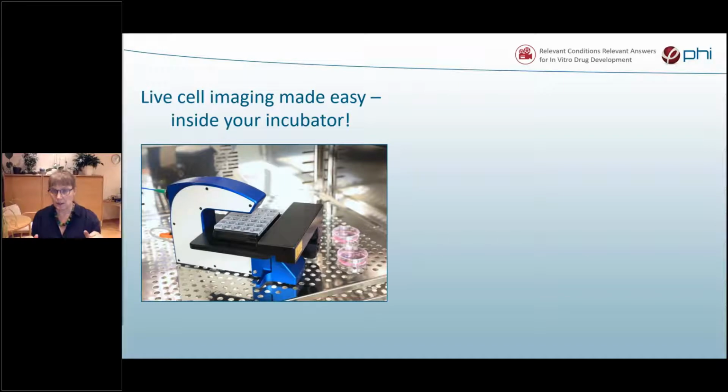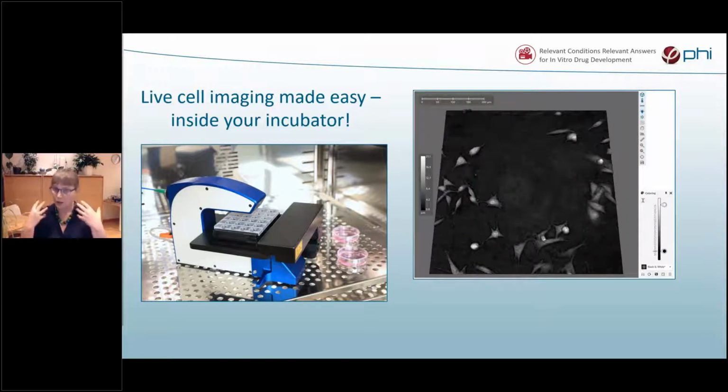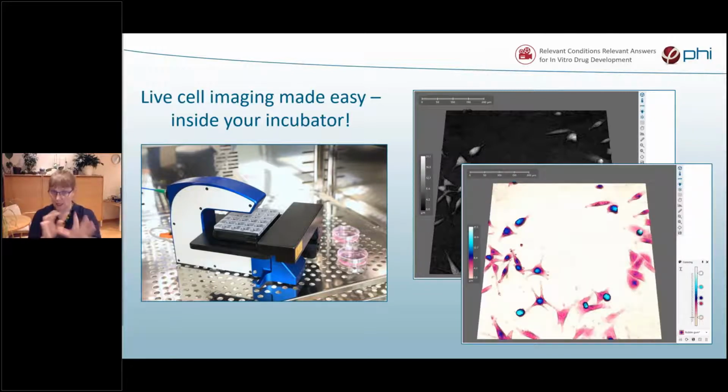We never capture any cell images. And then we put all that data into a computer, and the computer will reconstruct cells based on the delay of light. So in this picture here, the whiter the cell is, the thicker it is. This is a drawing made by the computer to show the thickness of the cell in each pixel. Beautiful cell image. And just for fun, we can add lots of colors, both to make it more beautiful, but also to enhance details. So all colors and all images you see in this presentation are reconstructions, software-generated images.